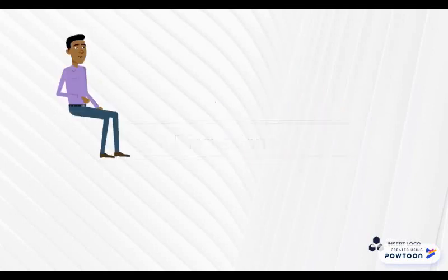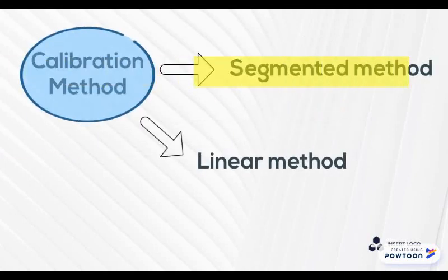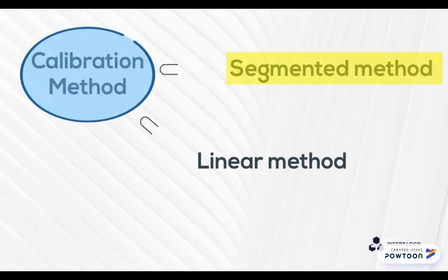According to theory, we have two calibration curves, segmental method and linear method. Segmental method is the method that permits precise and accurate determination of the correction data for low concentration solution. More calibration is done in this stage. And this method connects the individual points instead of drawing a straight line that cuts across the points. So it is only linear from point to point, but not necessarily across all the data points. And hence, this is what we call segmental method.